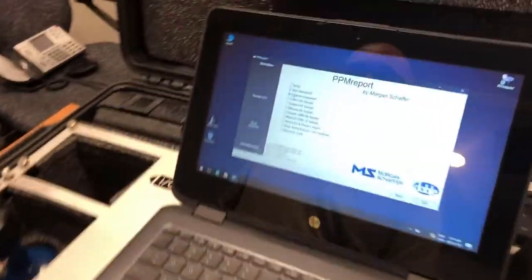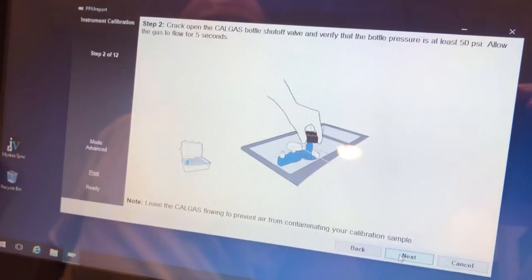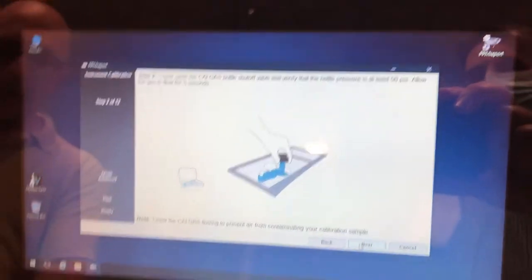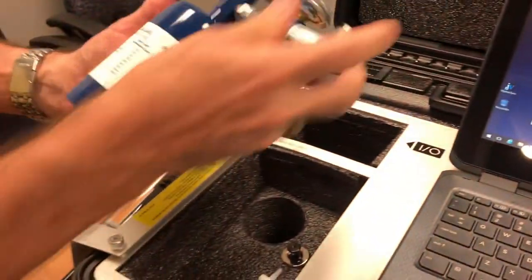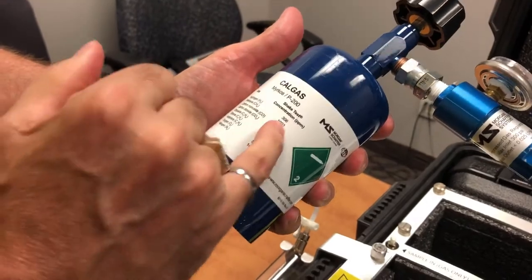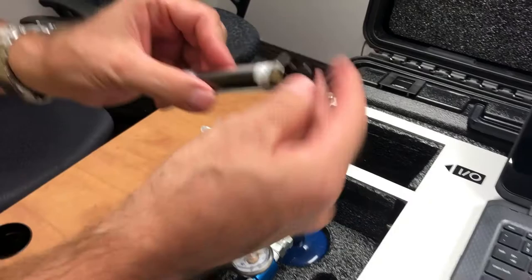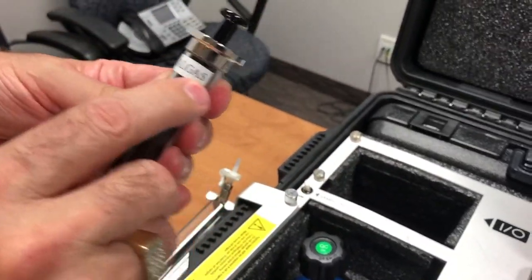You click on the calibrate logo and go next. With your Mircos, there's a bottle with a special formulation of all the gases you analyze — it's the calibration gas. You take that and take one of the syringes that says CALGAS.